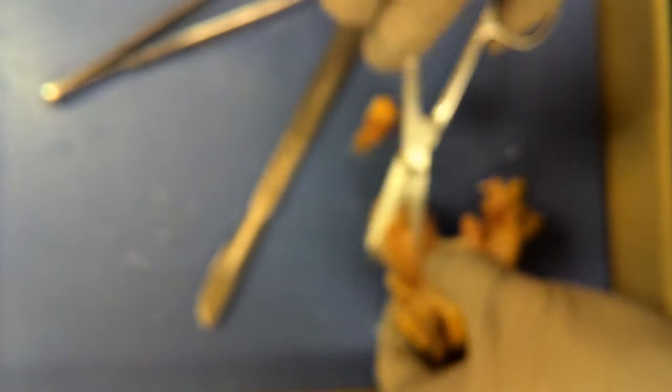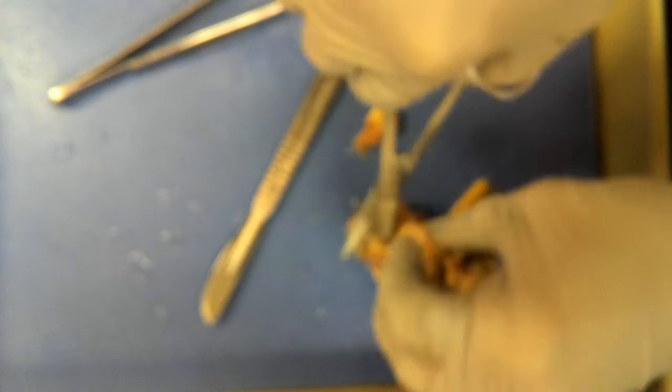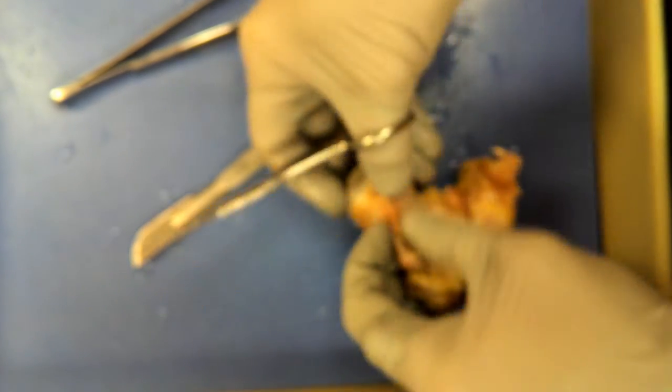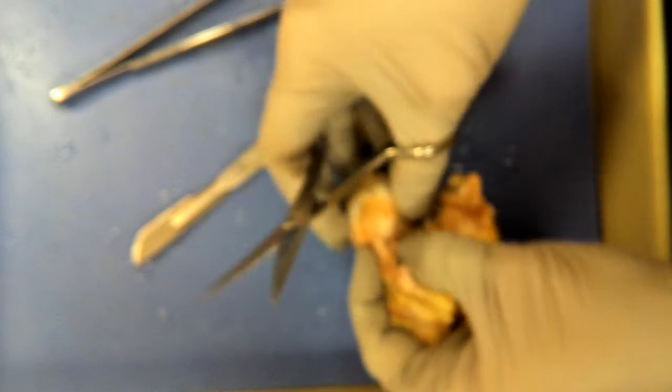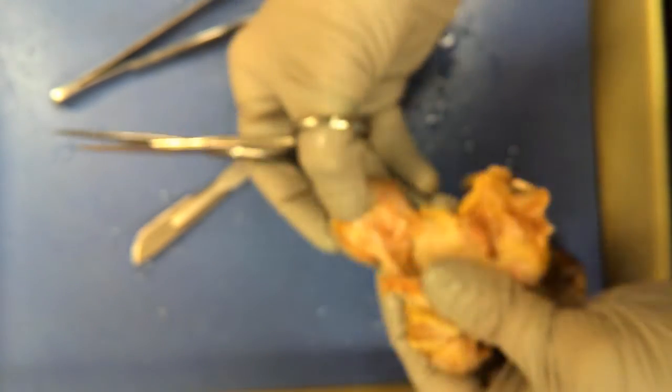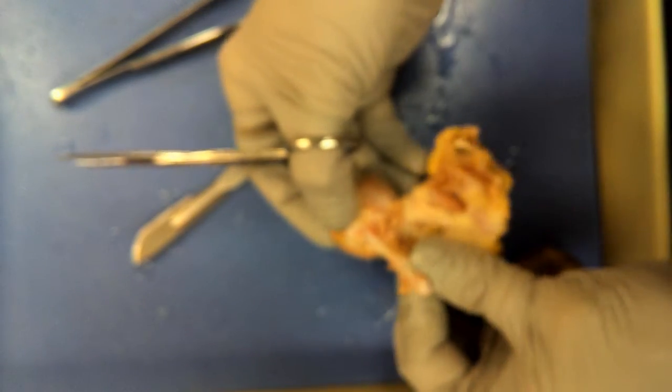I'm doing in two minutes what usually takes maybe ten for students. Oh look, there's the optic nerve right there — I've just totally butchered it. Oh well, there wasn't much of it; there's just a tiny bit.